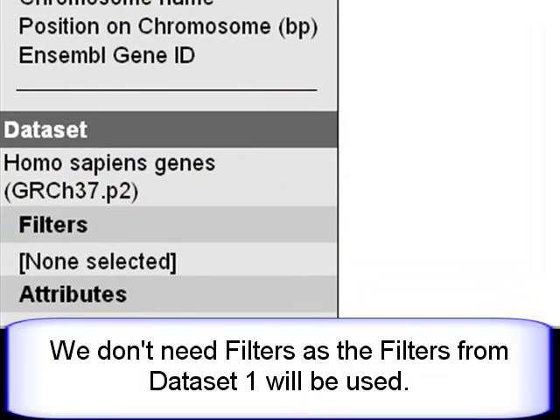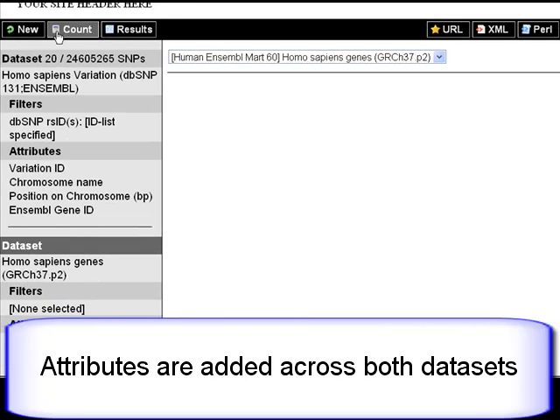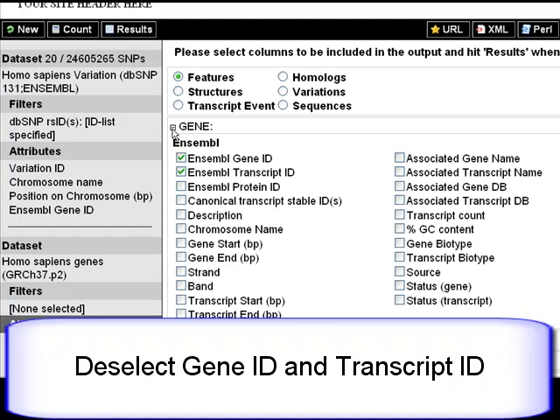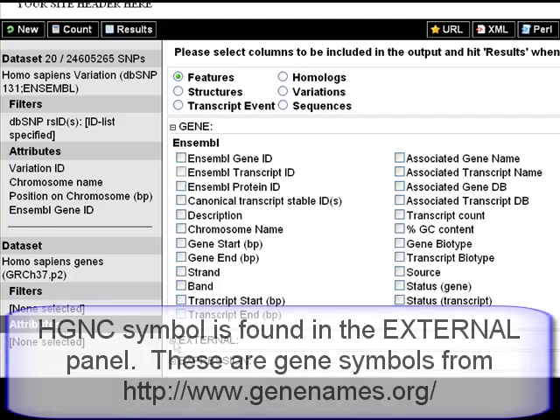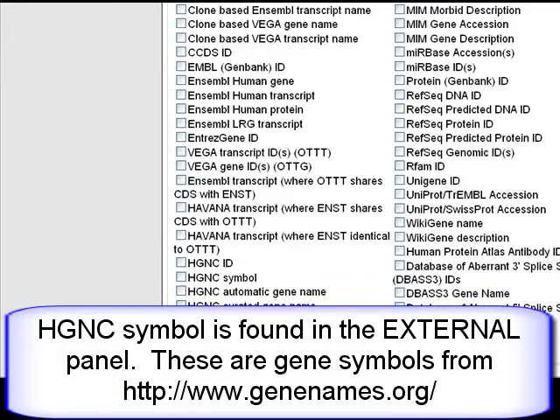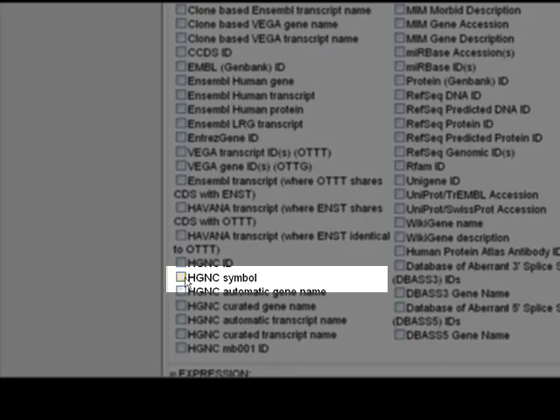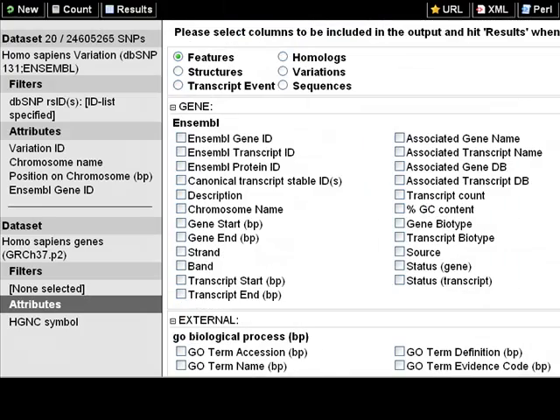I won't need filters because I already defined them in dataset 1. Click on Attributes. I'm going to deselect Ensembl gene and transcript ID. I can find the HGNC symbol in the external panel. The result table reflects all the attributes selected in both datasets.